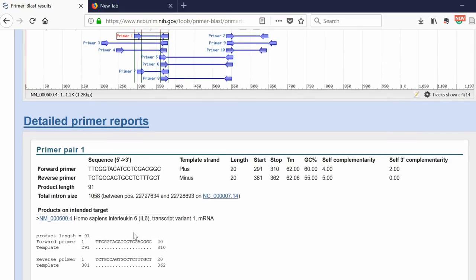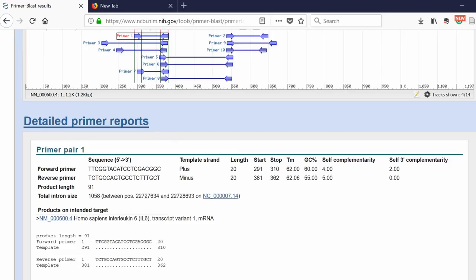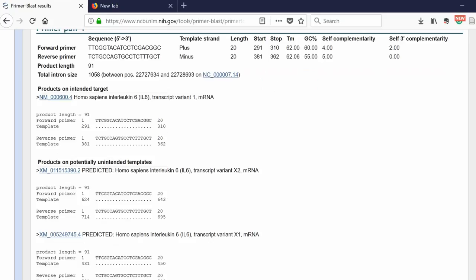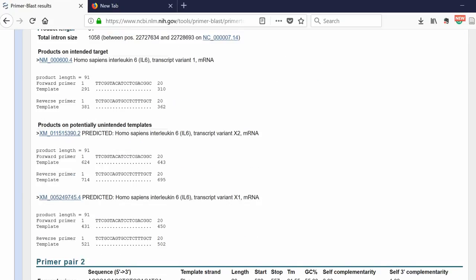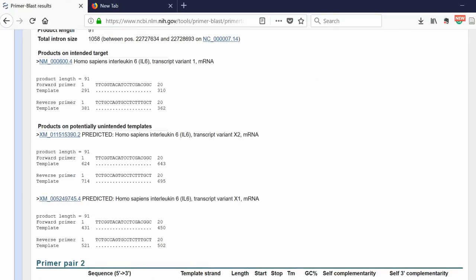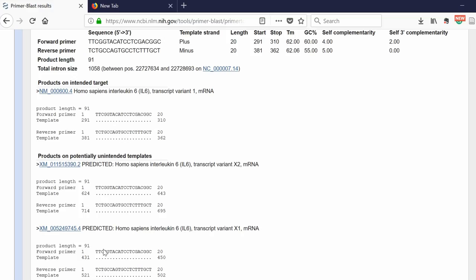Underneath, it's telling you that the products are actually binding to the right thing - the Homo sapiens interleukin 6 transcript variant 1 mRNA. You know that because it gives you the primer sequence here, and then it tells you the complementary binding is occurring with these dots. The advantage of using Primer Blast is that it will blast your primer sequences to work out if they could potentially bind anywhere else in that genome. It's picked out two results here.